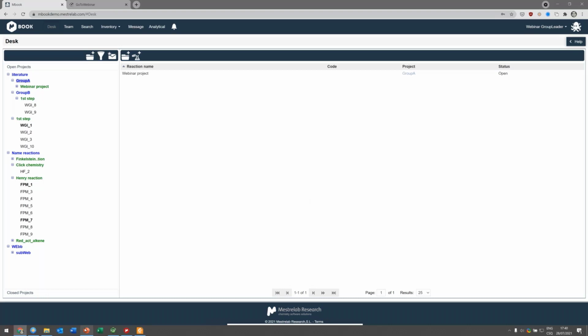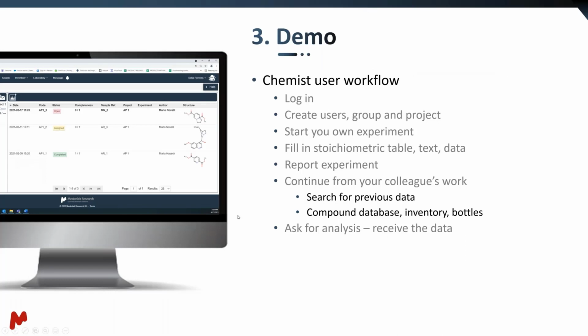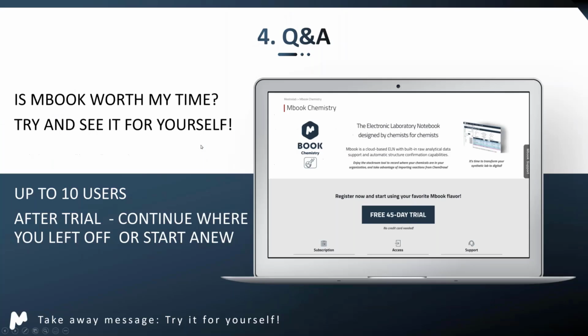With that, I think I have covered all the necessary things for the demo. And if I have missed something, you can just ask for it right now in a few minutes, and I'm able to show the remaining part which I have skipped.